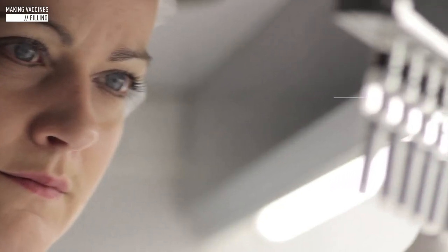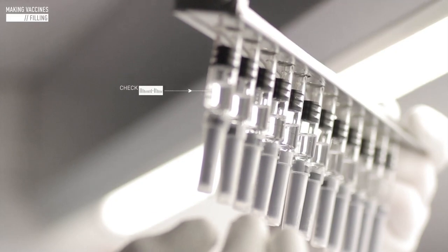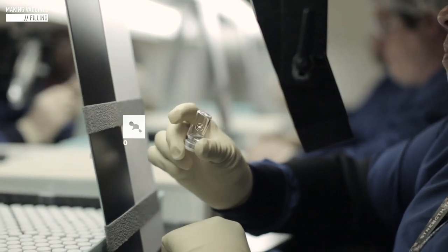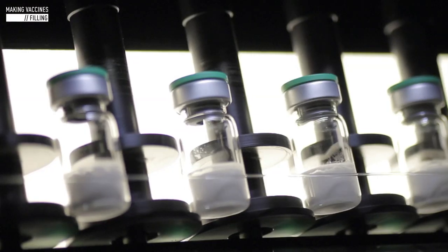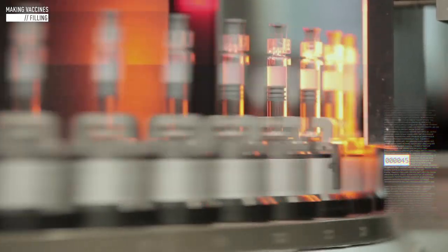When the filling phase is complete, each vial or syringe undergoes visual inspection. The quality of the contents and the container are scrutinized by both the human eye and state-of-the-art digital surveillance technology.